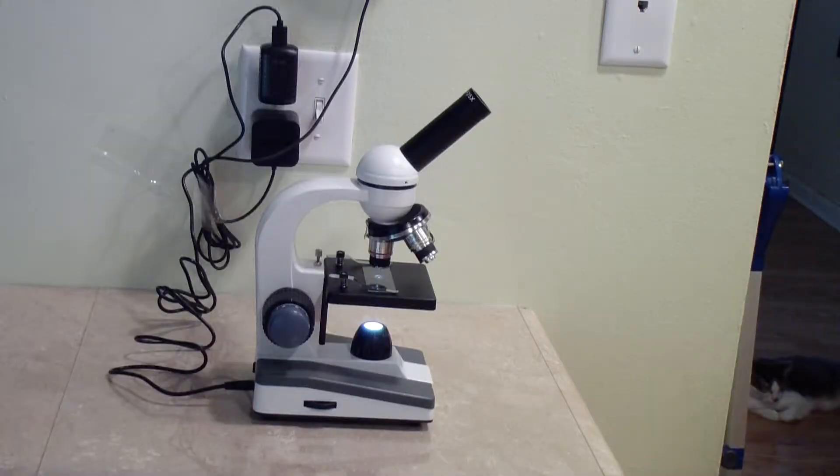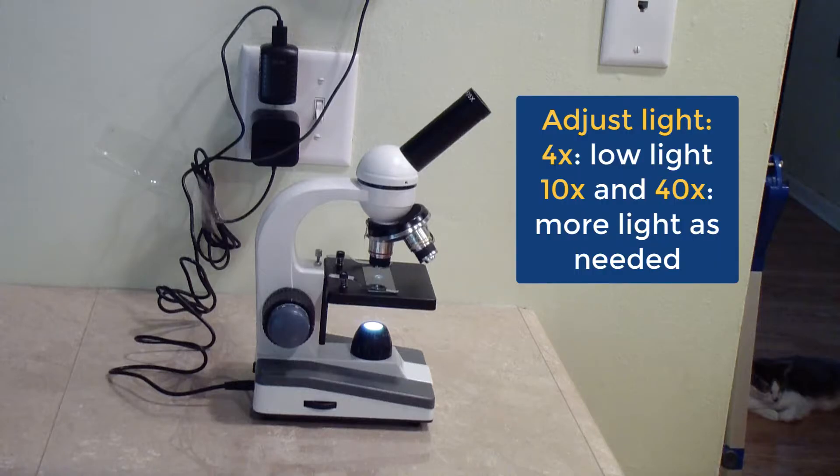Get used to adjusting the light as you look through the microscope. In general, when you use the 4x objective you should turn the light down with either the dimmer or the diaphragm.